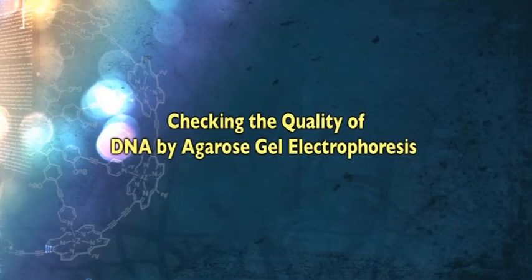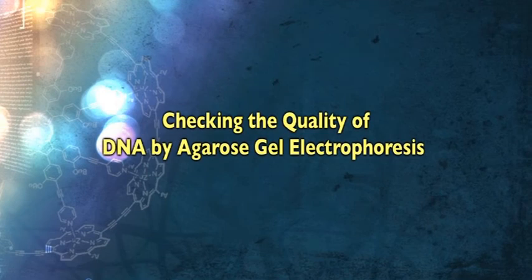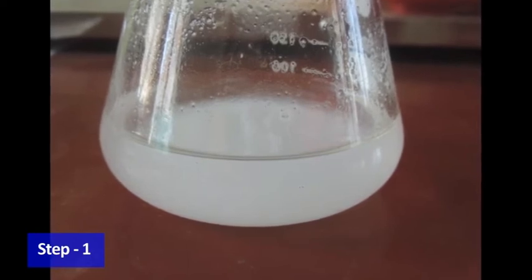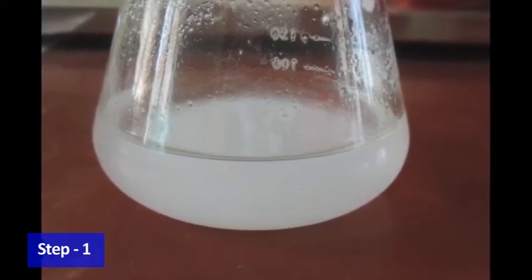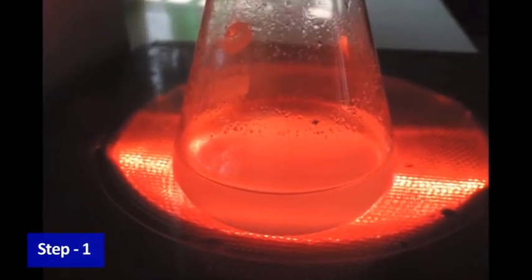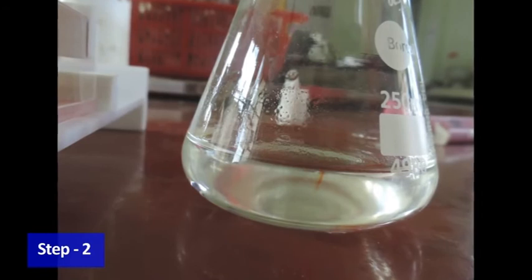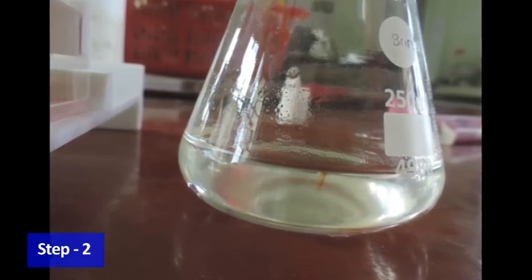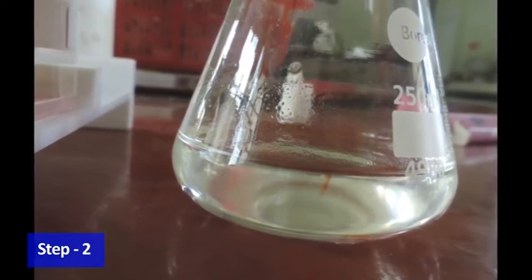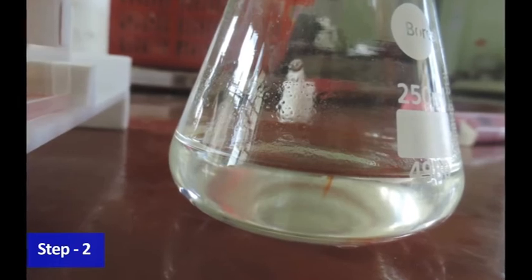The next step is checking the quality of DNA by agarose gel electrophoresis. For this, first mix 0.5 gram of regular agarose powder in 50 ml of 1x TBE buffer and microwave for about 1 minute to dissolve the agarose. Leave it on the bench for about 5 minutes to let the solution cool down to about 60 degrees Celsius, which is just hot enough to be able to hold with bare hands.